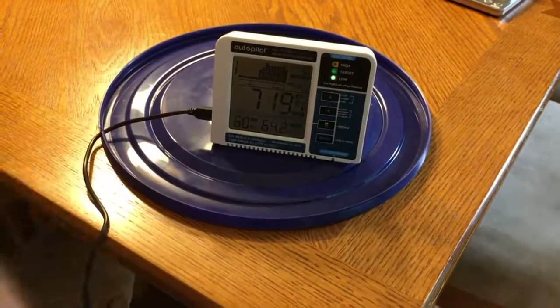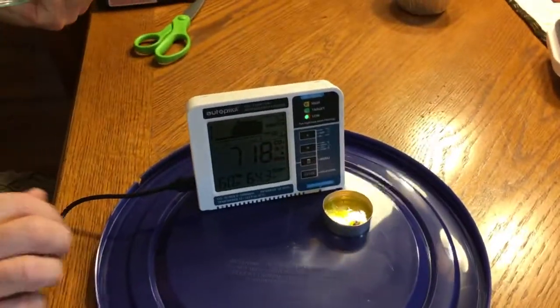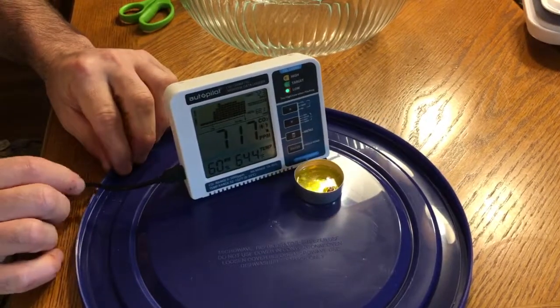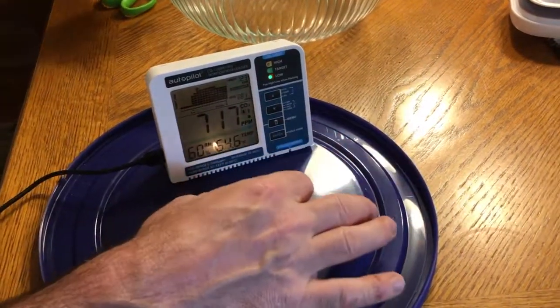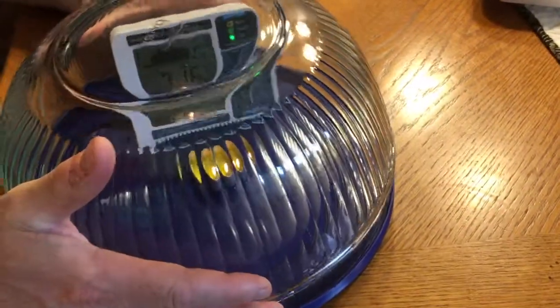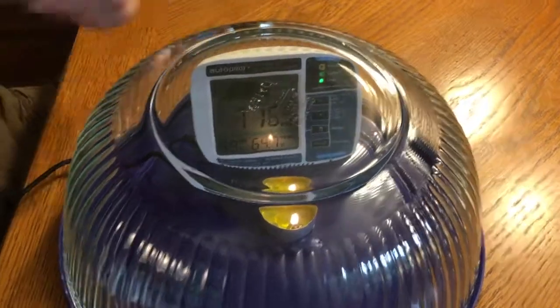I'm actually going to move this over a little bit so that you can read it through the top. That will require me to move the wire a little bit. Close it up. It's not completely airtight, but it's good enough for trapping some of the gases in there.